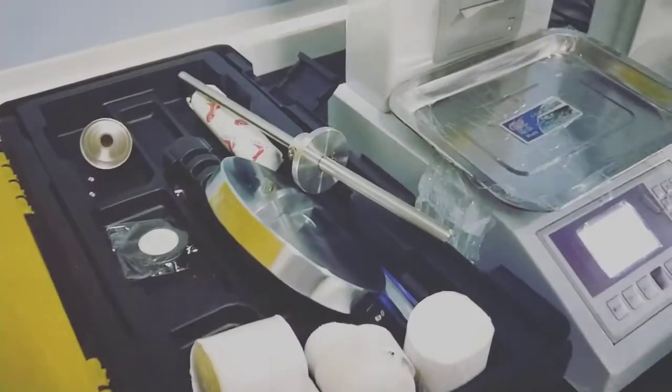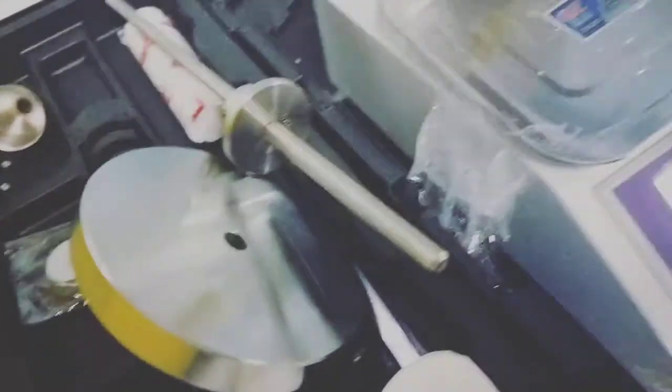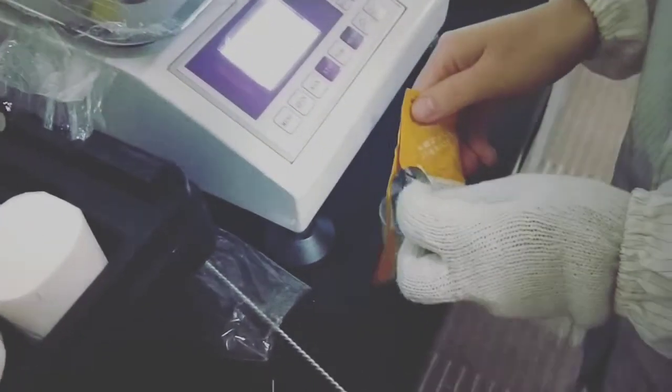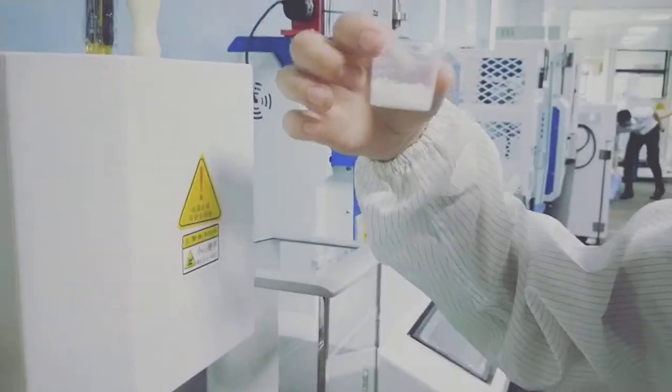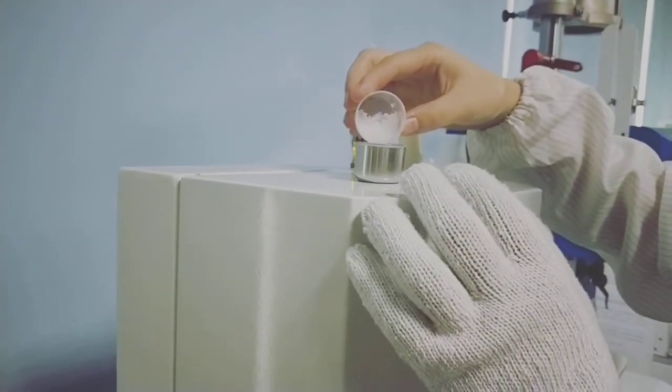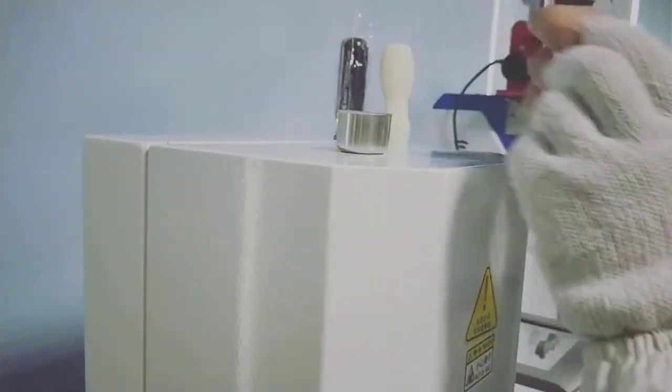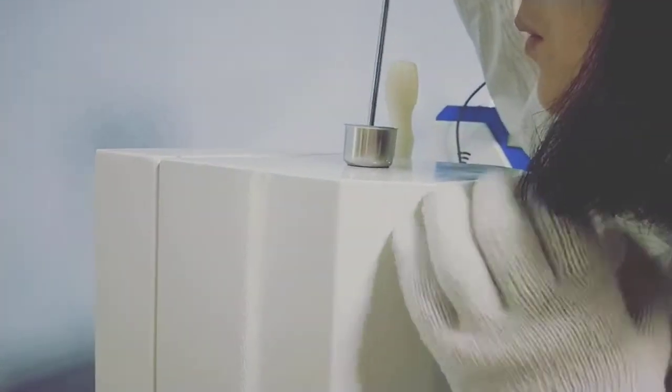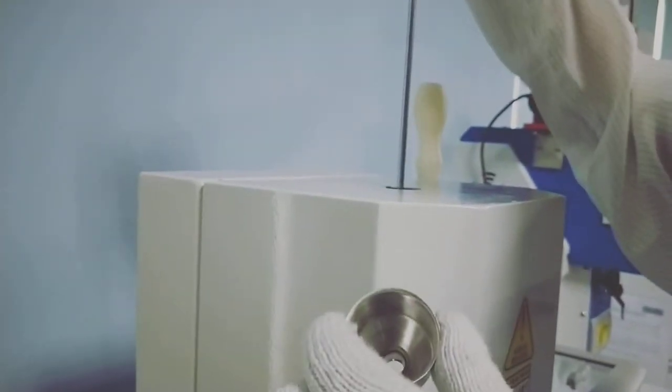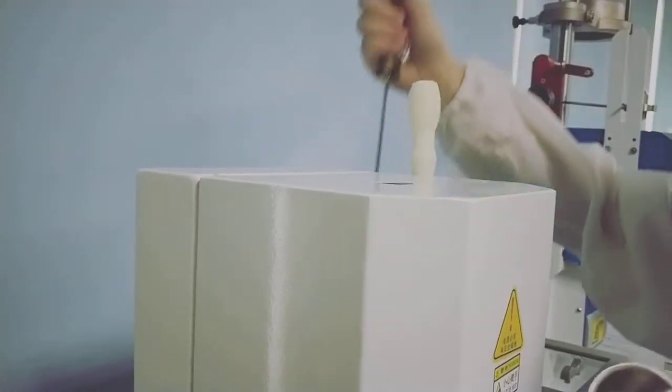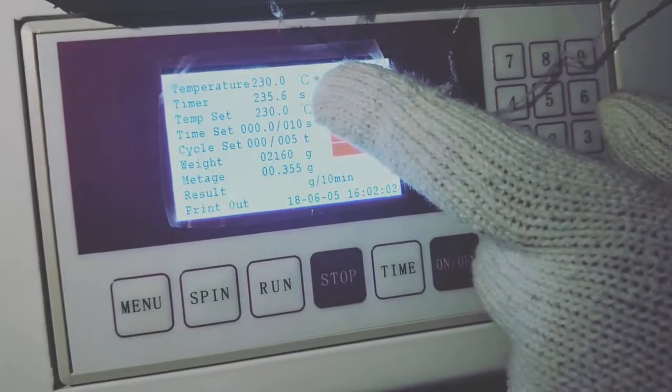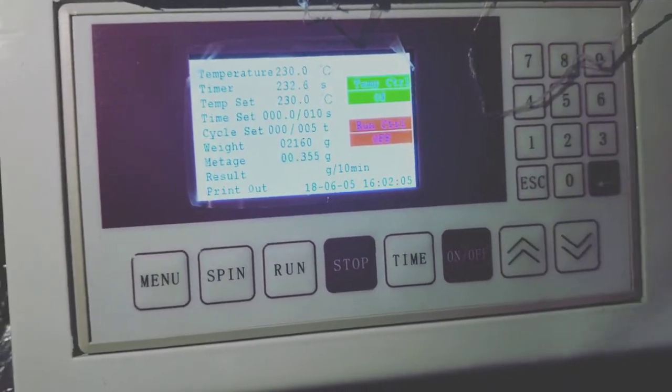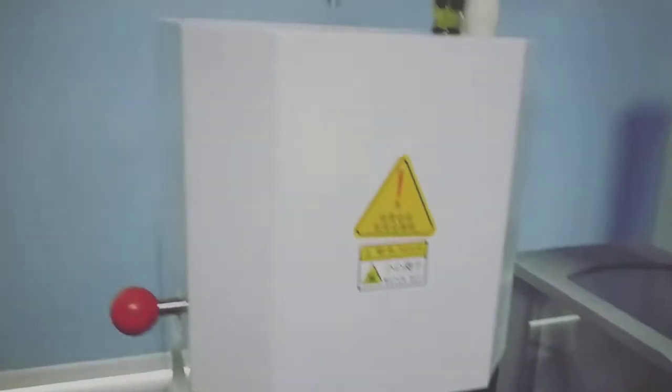Then we add sample into the hole. Normally we need max 7 to 8 grams each test. This is the sample each time we use. And use this one to add the sample into this hole. Press time key. It will automatically calculate 4 minutes, 240 seconds. Then we just wait. And then add the sample.